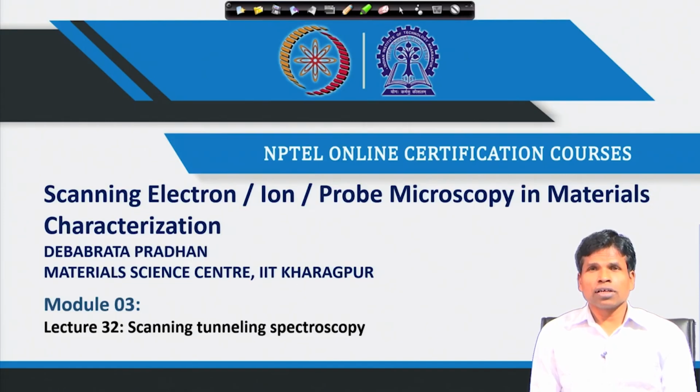Welcome back. In our last lecture, we discussed STM imaging, different modes of operation like constant height mode, constant current mode, and how to get the image. A little bit about image processing, and the different artifacts in the image. So, after considering the imaging, we are going to move towards spectroscopy, scanning tunneling spectroscopy.